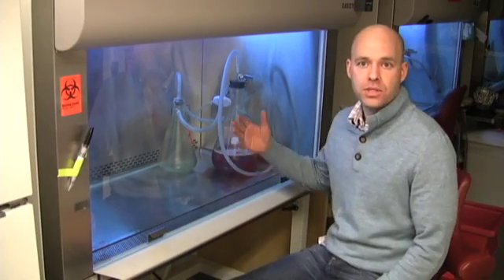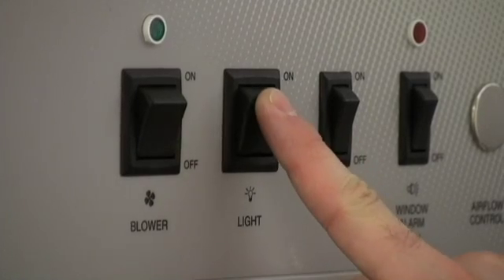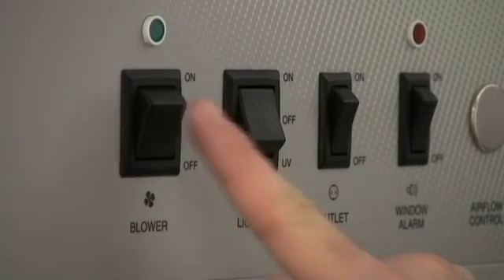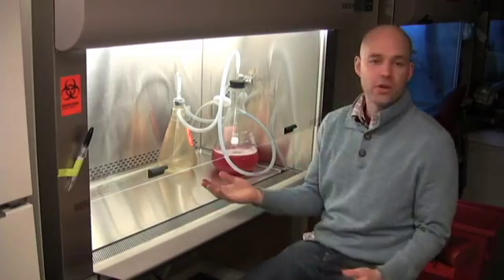So when you show up to a hood many times the sash will be down and the UV light will be on. The first thing you need to do is turn off the UV light and turn on the blower. At this point you can raise the sash and you should hear the blower turn on.